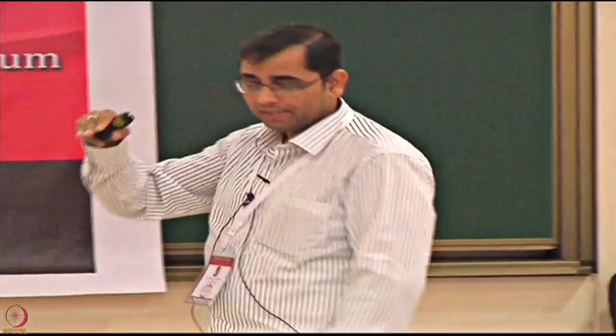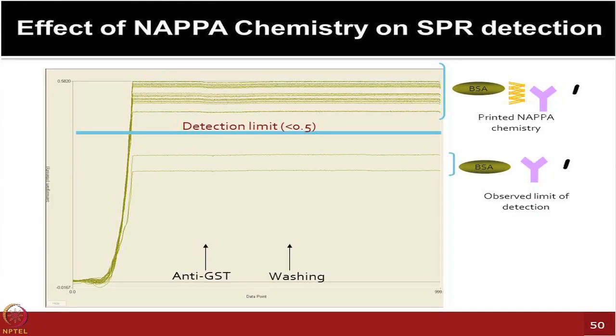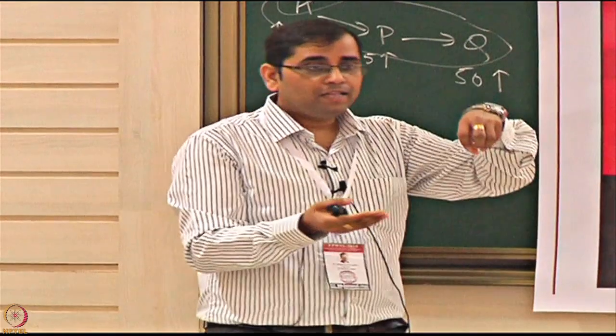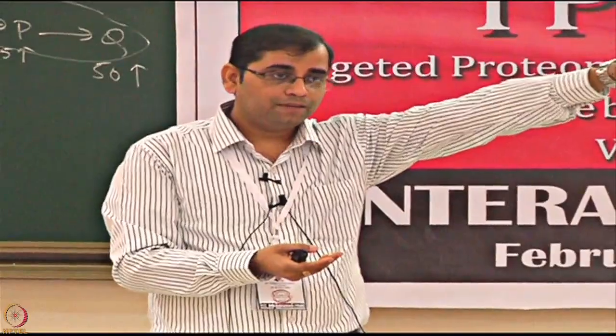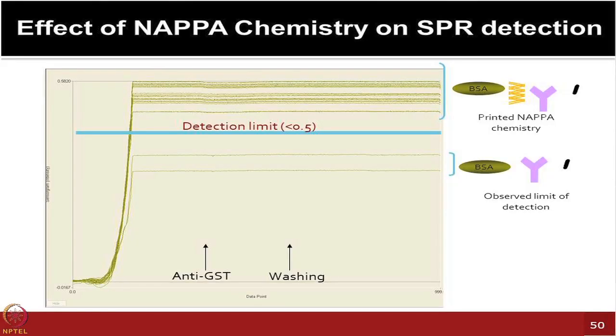All of them were actually making the whole mass too much, which you are adding on a given chip surface. So in the initial experiment, when you are printing so much mass on the gold chip, in SPR kind of platforms you are only measuring how much binding you can see happening. To begin with, the baseline itself is going off the response unit. So here you have literally no room to find out how much binding you can observe later on, because with the buffer alone, the baseline itself is very high, passing beyond the response unit of the instrument.